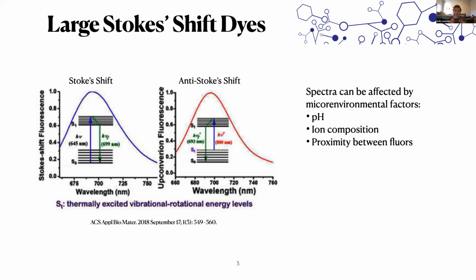So the third, just to quickly cover FRET, because that's really how we attain long Stokes shift. If we have organic fluors that have what we consider to be a wide Stokes shift or long Stokes shift, they're going to be extremely low energy because their quantum efficiency is going to be very poor. So they're not always very useful to us. The way that we have attained long Stokes shifts now is almost entirely by FRET, what we would consider long, which I'm going to kind of cover that too.